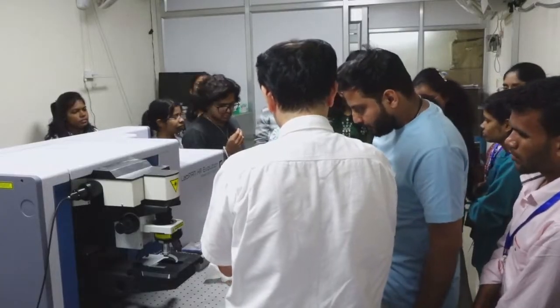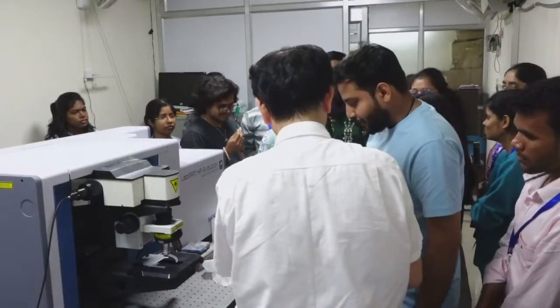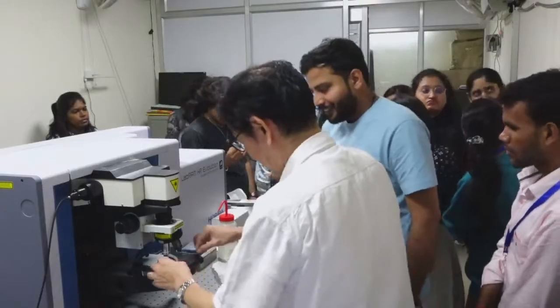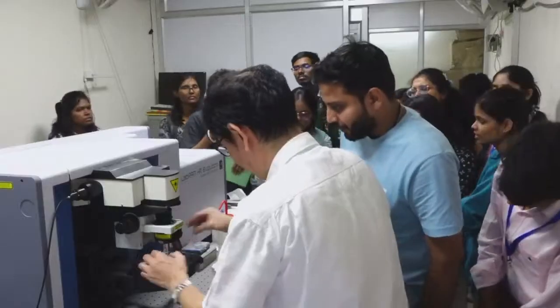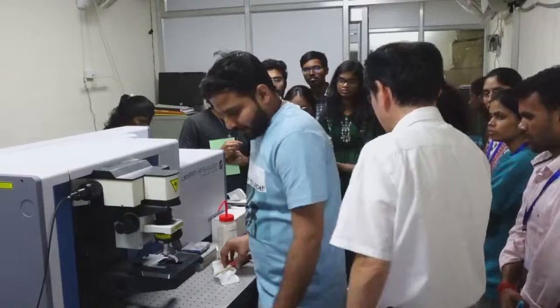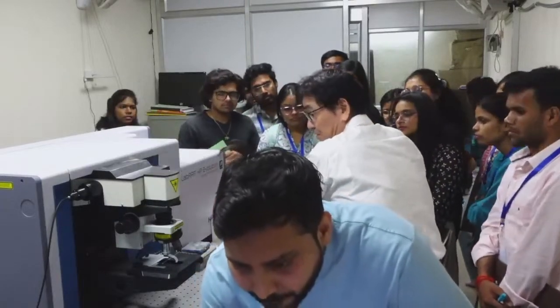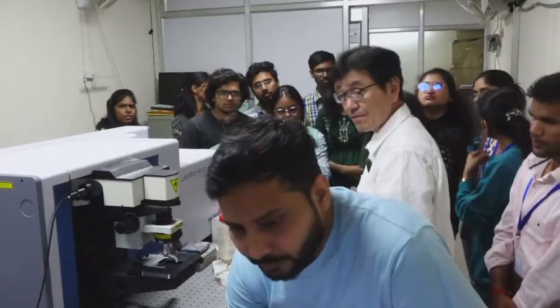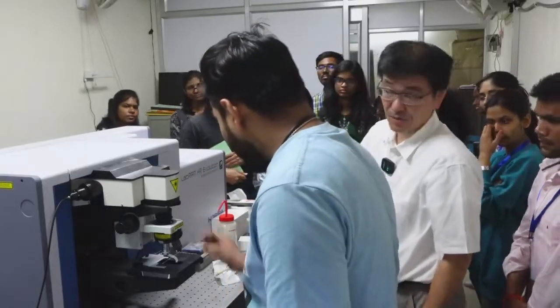Okay, shall we measure this part? I don't know how to do it with this. So, just placing the sample there. Irrespective of the sample preparation or setting, we put it on the microscope stage. Then we will see where the sample is by checking the physical image.